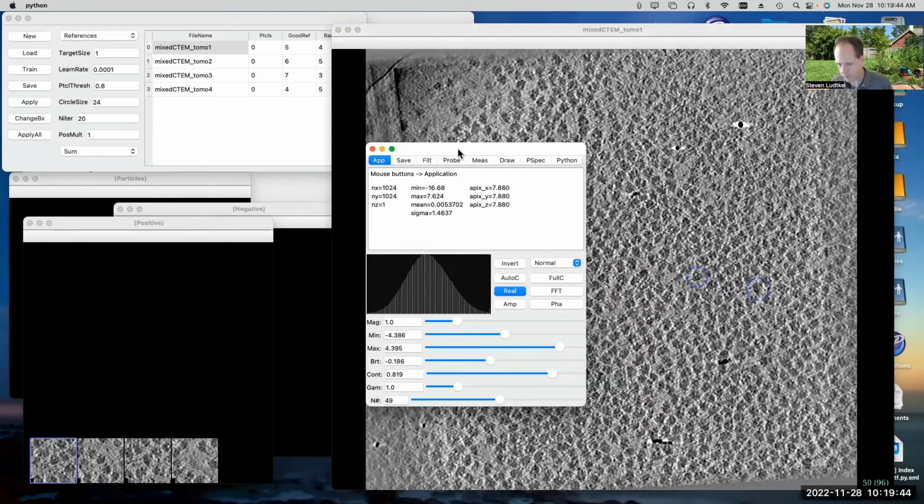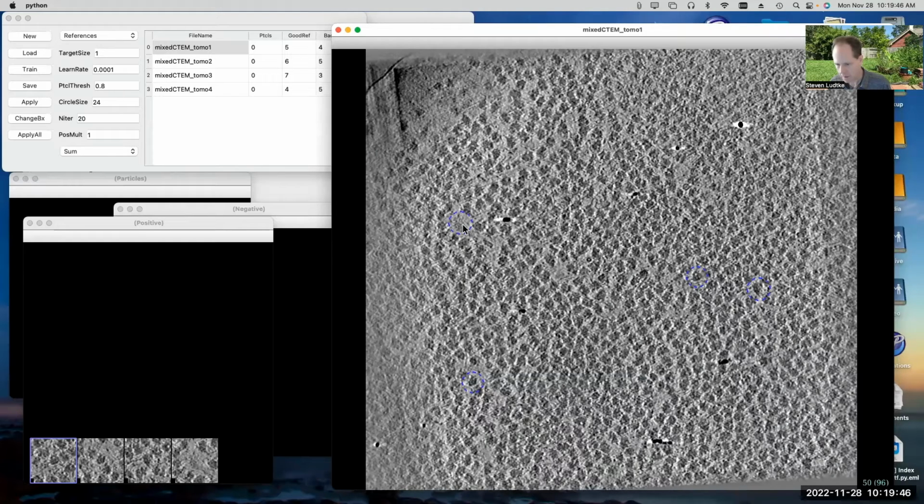You have to hold, oops, sorry. Again, you can hold down Shift to get rid of things. On the Mac, you hold down the Command key, but it's going to be different on different platforms. That's how you get negative examples here. There isn't any mode that you can target over here to get negative examples. You have to actually hold down the particular keyboard key to do it.